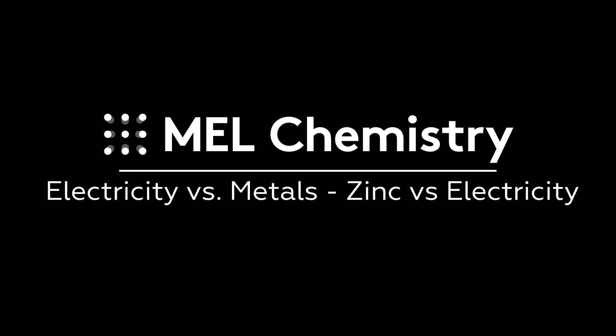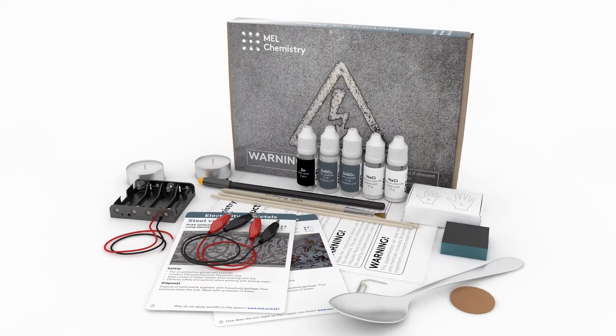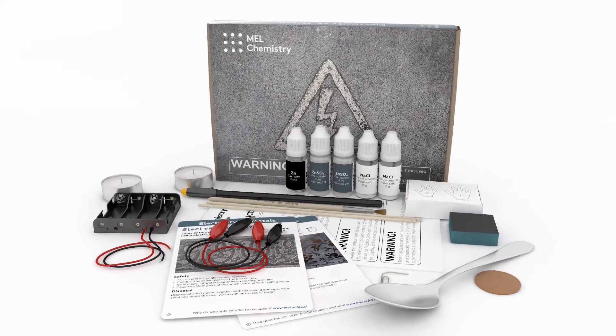Welcome to the wonderful world of chemistry. Today, with the help of the Metals vs. Electricity set by Melchemistry, we will make an image on a copper disc with the help of zinc and electricity.